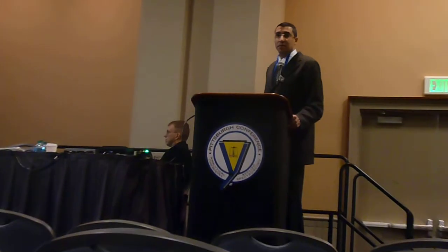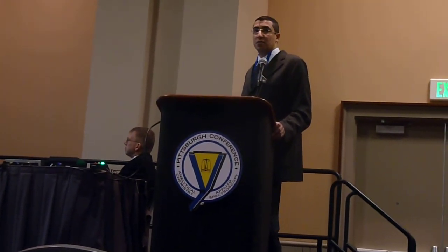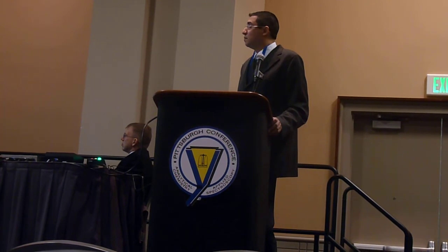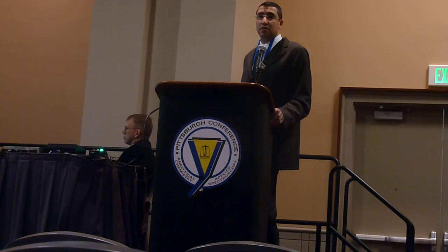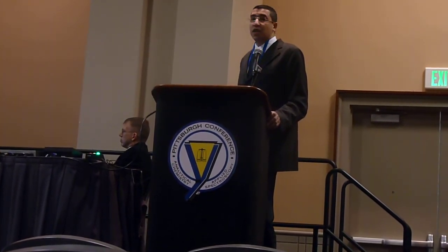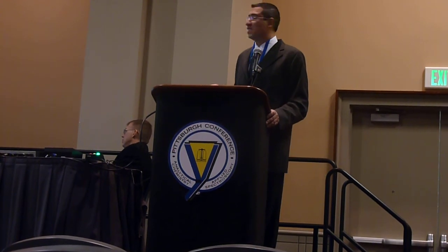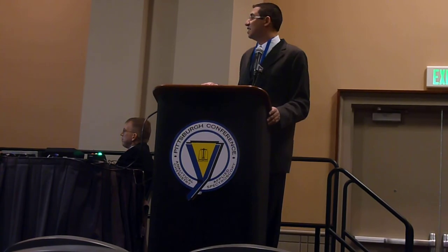To summarize my experiment: the system is very high throughput. It's 23 minutes using nitrogen carrier. The results demonstrated exceeded the standard methods in ASTM and UOP. Of course, nitrogen carrier is reproducible. We have a lot of nitrogen. Helium is running out. We can only use so much, and at a certain point we won't have it anymore.